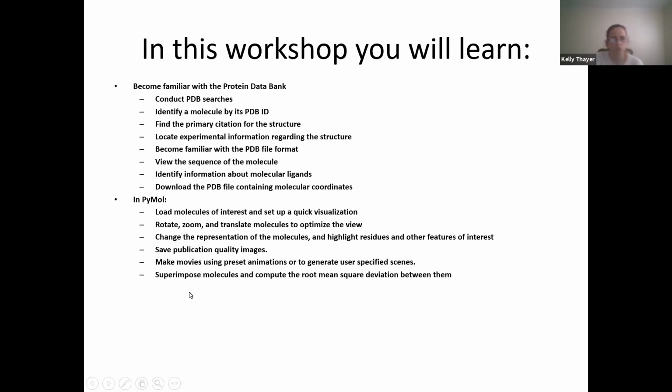And then in the section with PyMol, you're going to load molecules of interest and set up a quick visualization of them. You'll practice with rotating, zooming, and translating them. You'll change the representation of the molecule and practice by saving a publication quality image. You can also make movies using the preset animations that we previewed here. We will take you through step by step, actually all the commands to make the movies in the tutorial. Then you can superimpose the molecules and compute the root mean square deviation, which is a common number to compute in order to quantitate what the differences between two structures are.